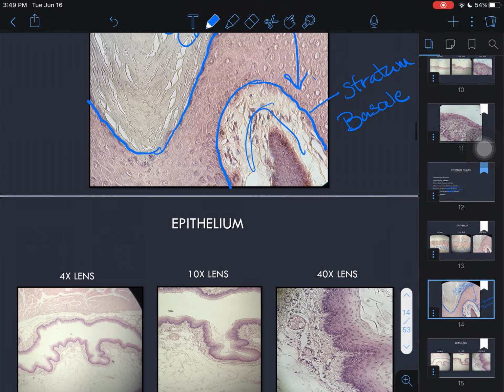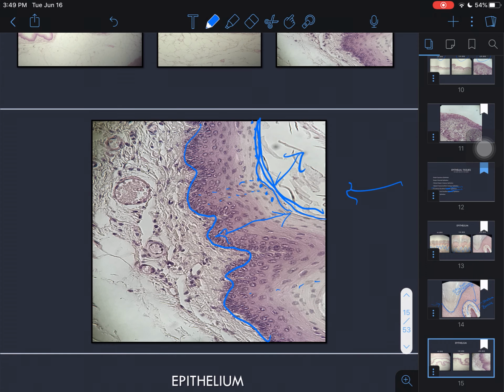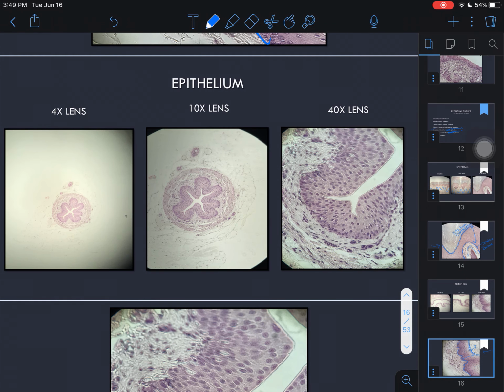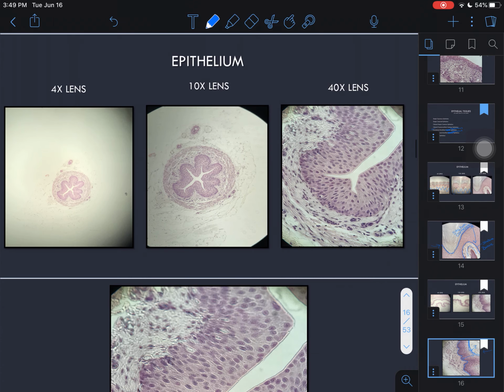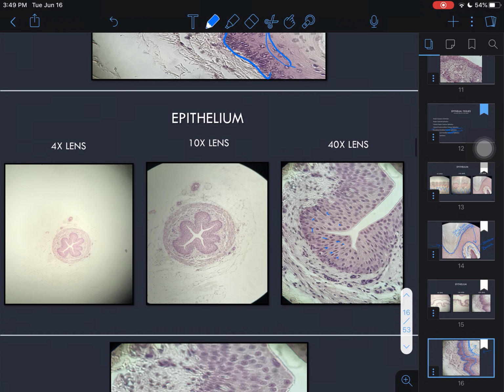So we're coming down. We've looked at these two, right? Keratinized stratified squamous epithelium, non-keratinized stratified squamous epithelium, and our final one, which is transitional epithelium. All these dots make it look like it's very similar to our non-keratinized stratified squamous epithelium. This little star or snowflake center reminds us of another tissue, right? It reminds us of our ciliated simple columnar epithelium.